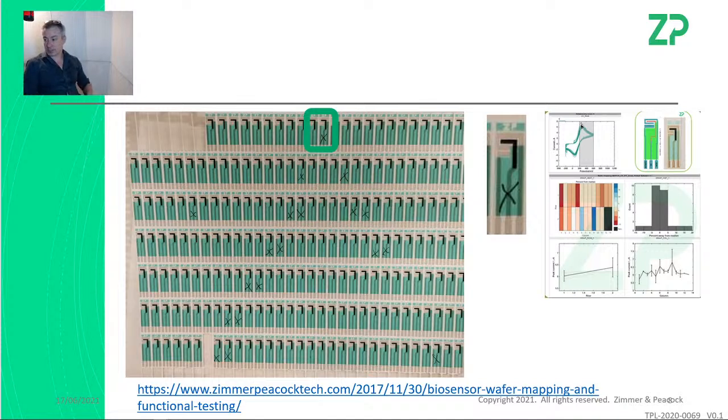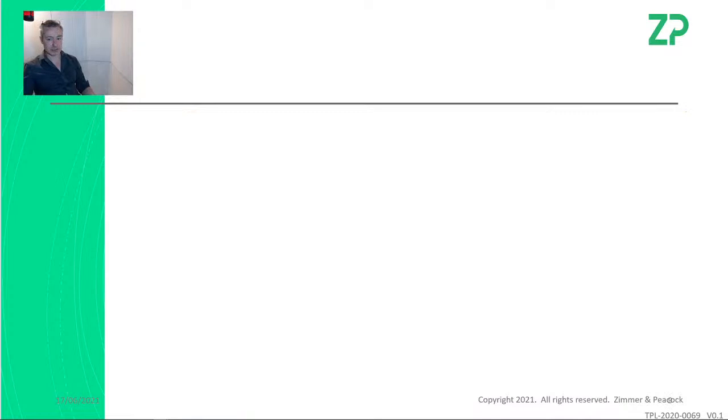Hasim's just said, good QC, Martin. Yeah, he's right. We're visually checking them. We've functionally checked them. And it's really the only company that does this mass checking. Now let's dive into the inquiry. So if you got crosses on them, keep them, use them for optimization, but don't use them for collecting final data. Now the inquirer had a few things.